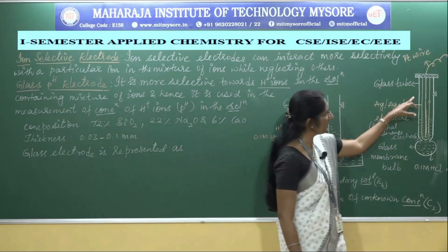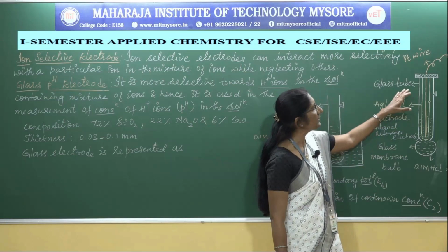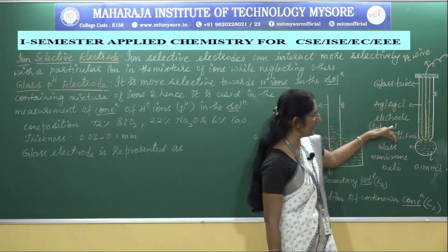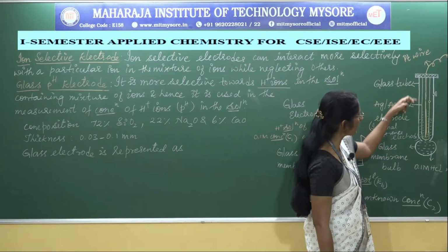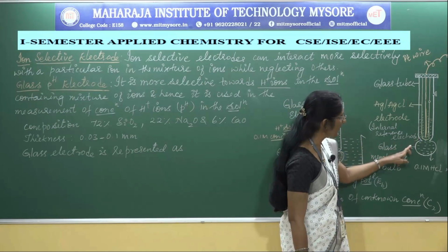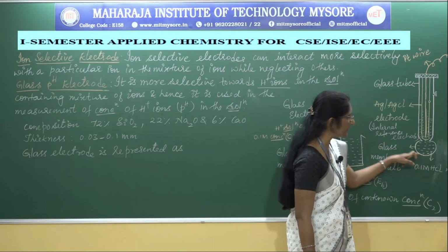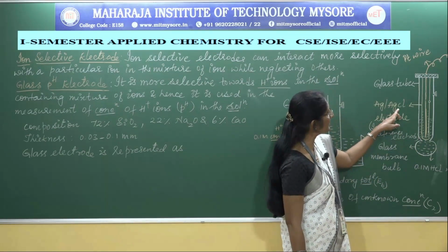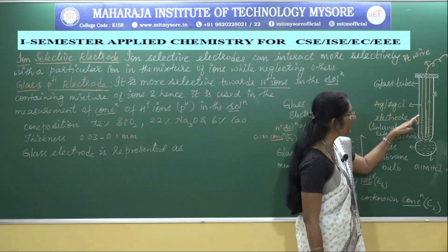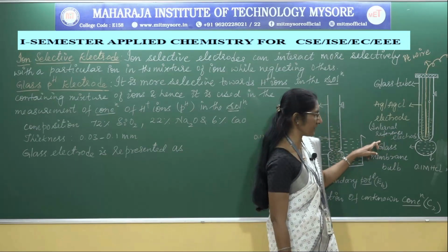This diagram represents a glass electrode. It consists of a long glass tube having a small glass membrane bulb at its bottom. A silver chloride electrode is inserted in it and acts as an internal reference electrode.